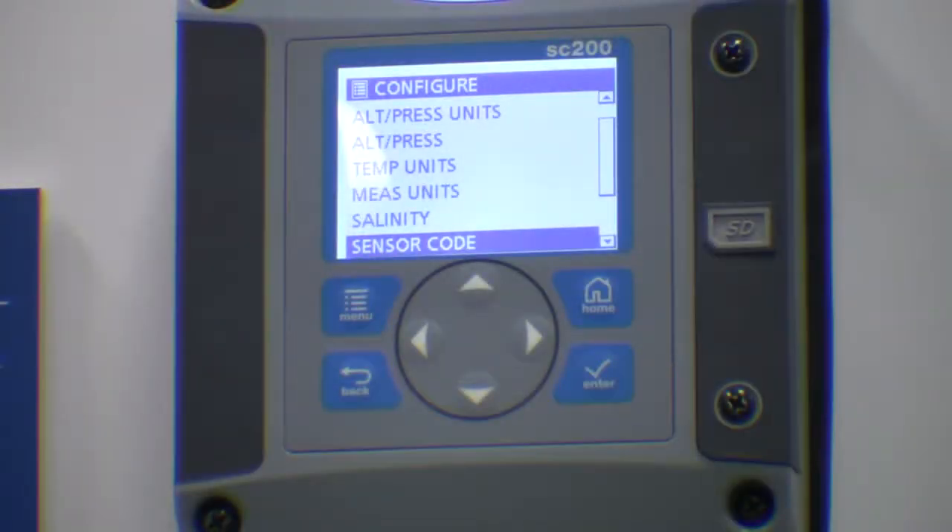If the sensor code is entered incorrectly, 'sensor code invalid' appears on the screen. At this point, please re-enter your code.